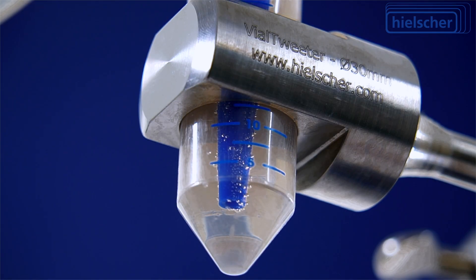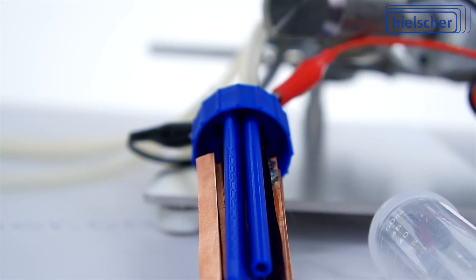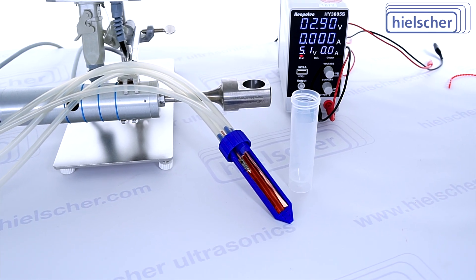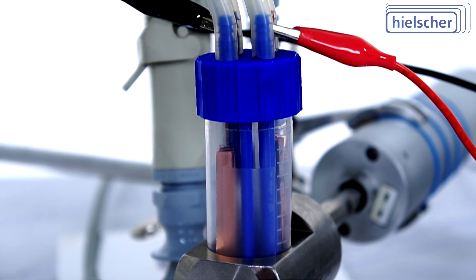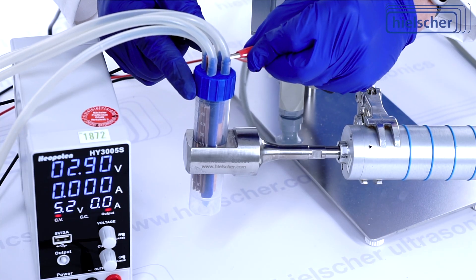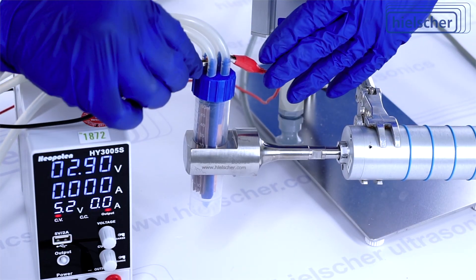When used with a specialized electrochemical cell lid, the falcon tube becomes an innovative sono-electrochemical cell with ports for electrodes, gas discharge, and liquid recirculation. By integrating sonication with electrochemical processes, the Vial Tweeter significantly improves reaction kinetics.